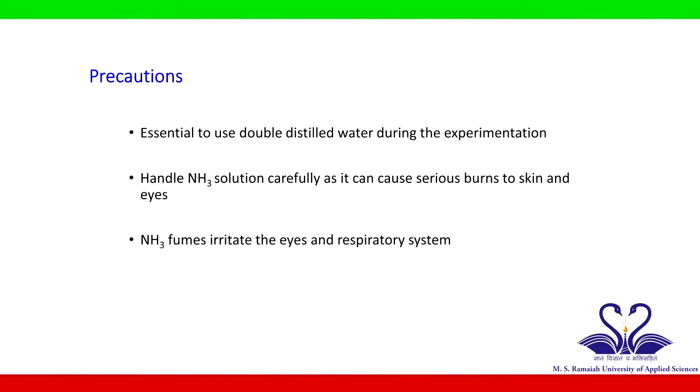Precautions. It is essential to use double distilled water during the experimentation, as tap water may contain salts of calcium and magnesium. Always handle NH3 solution carefully, as it can cause serious burns to your skin and eyes. As ammonia fumes irritate the respiratory system, don't inhale it deeply.